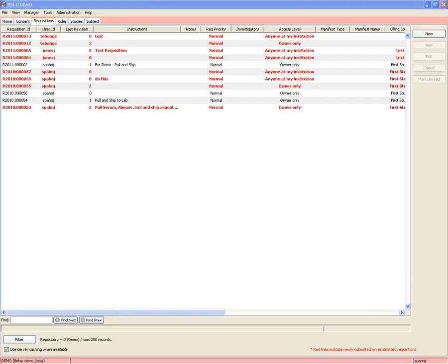Does BSI maintain versions of each consent form? It does if you create a new version. So what you'll have to do, it doesn't maintain changes, but we have a history of changes, so yes, it keeps an audit trail. But if you were going to add a new consent form, you would have to inactivate the old version and then add a new version.